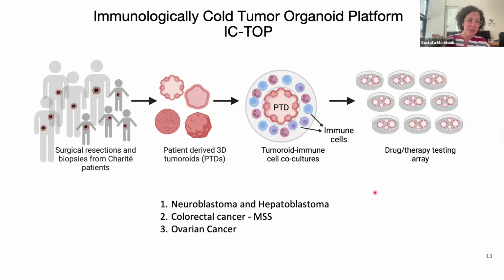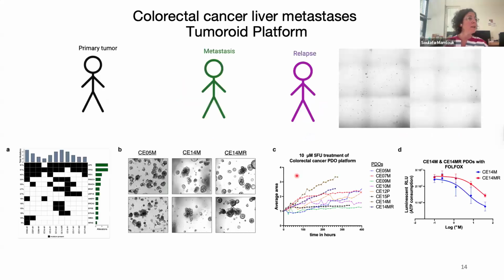So your patient comes in, you grow their organoid, you can check a few treatments, and you inform the clinician of what you find in terms of response. But what we do is then watch them evolve. And most importantly, we interfere with their evolution, which is very cool. So you're no longer looking at the past of what has already happened. You're seeing it happen in culture, and you're manipulating it.